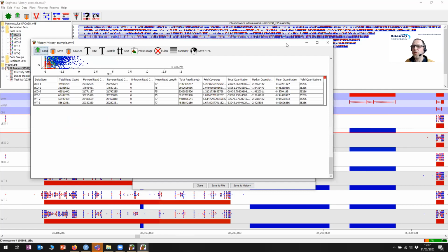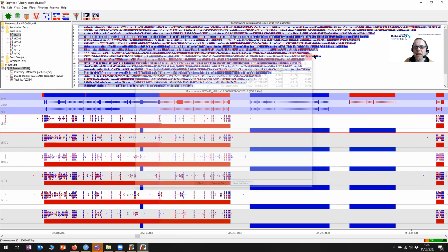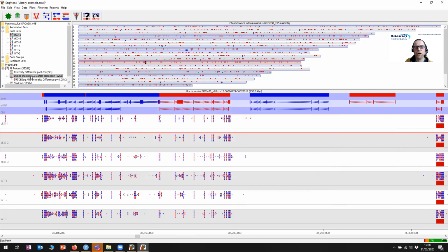So another thing that's useful to know about this is just to have a look at some of the options for annotating up tables in here. So again, this is something that's changed relatively recently in SeqMonk, and where we have more flexibility than we used to. So as an example, what I've done in this project is I've done a fairly standard sort of RNA-seq analysis where I've done a DE-seq differential expression to show that I got sort of 2,266 genes that change between my two conditions.